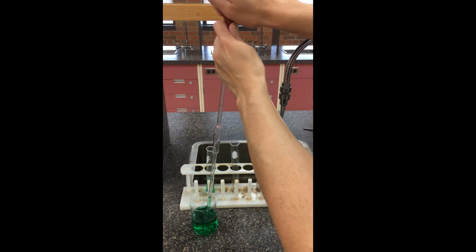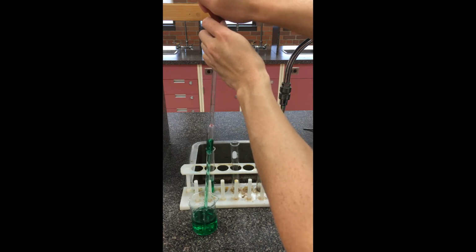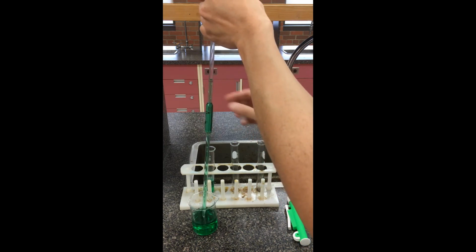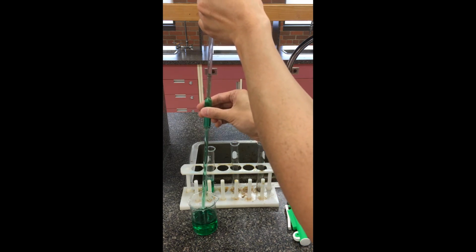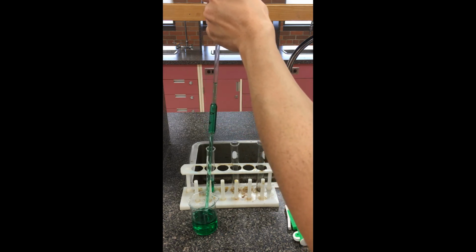So I just soak up that solution. Again, what we want to do is go past that mark there, and then as quickly as you can, put your finger on to form that seal that we need. Okay. So again, I'm a little bit over, which is good. I'm going to wiggle my thumb on the top here, and then we're going to wait till this line here is exactly at that 10.00 mark.